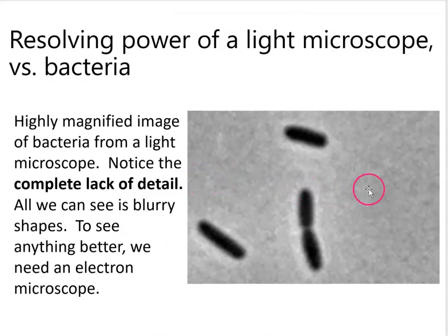Well, that's all I really have in these slides for microscopy. I just want to point out one other thing. What are we looking at here? Why are they dark against a light background? This is actually a picture taken from a microscope that generates its own contrast. It uses the difference in refraction between the water and the cells.